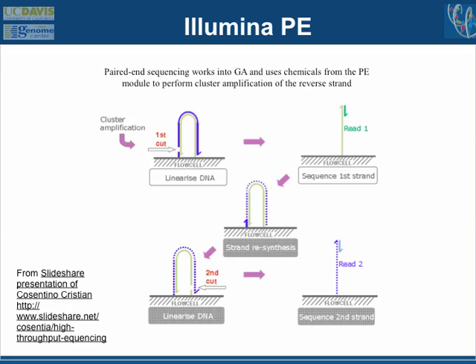The way it works with the Illumina sequencing is pretty simple. You take your DNA pieces, you add your adapter tags, and then you run a sequencing reaction. And in essence, you can wash all the reagents off the plate and run the sequencing reaction with the other primer, the other adapter, and now you're reading the sequence in reverse.